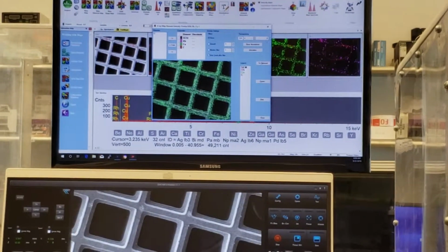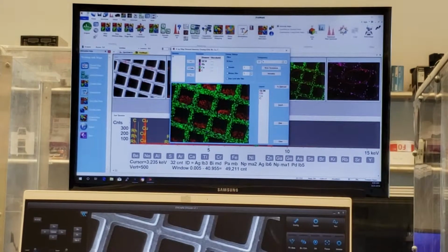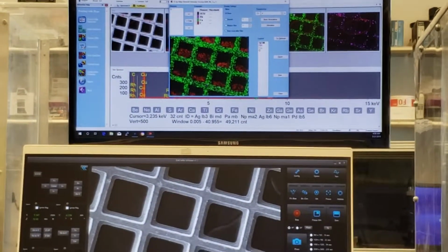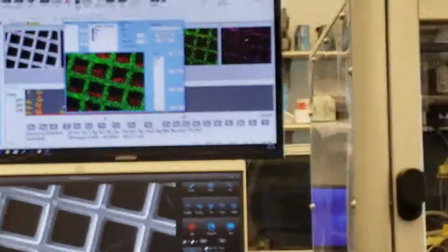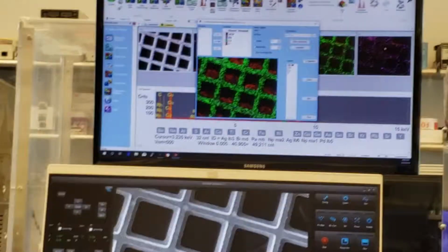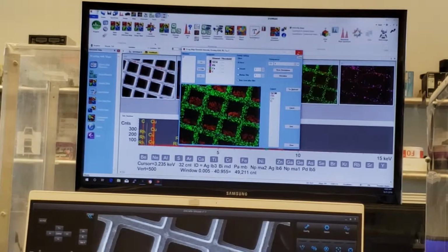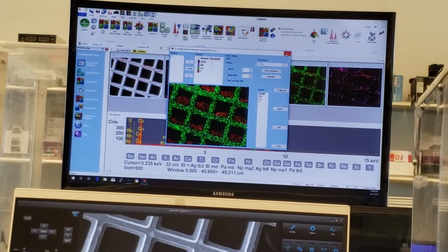Can you overlay 2 maps? For example, you save 2 projects. You could have 2 maps open to compare them, but overlaying one map on top of another map, realistically, is kind of redundant, because you're already mapping it. You know what I'm saying? Yeah. Just get those elements that you told it to. I see. Because this is generated for this map, the elements are analyzed. That's right, for this exact one.